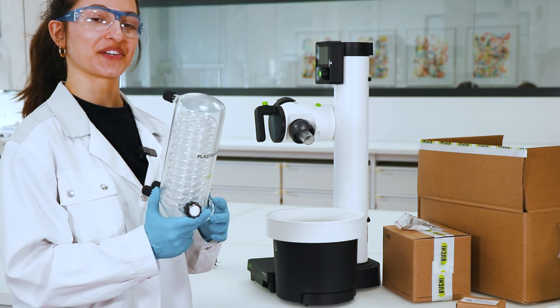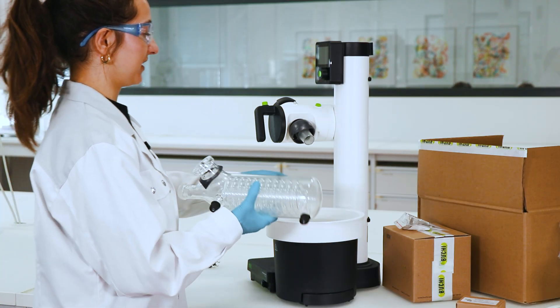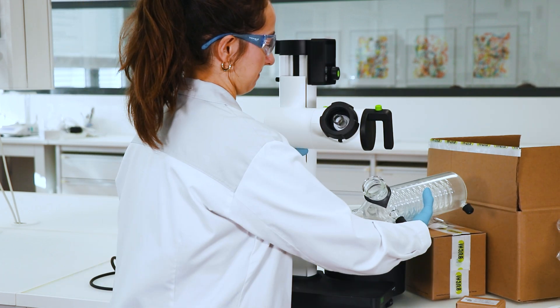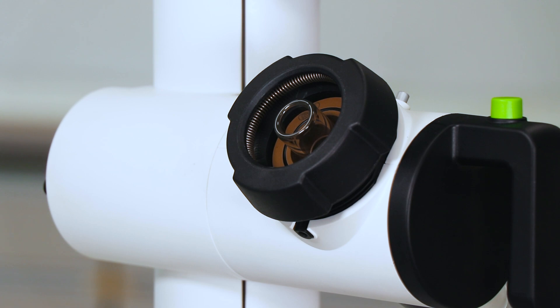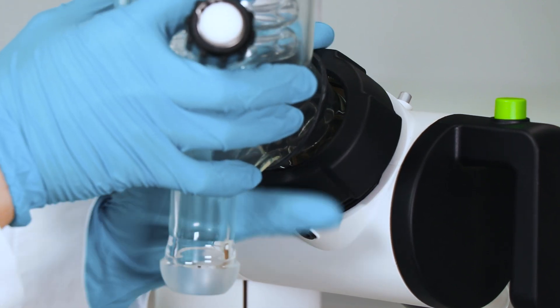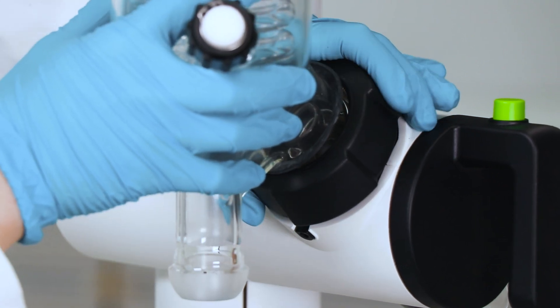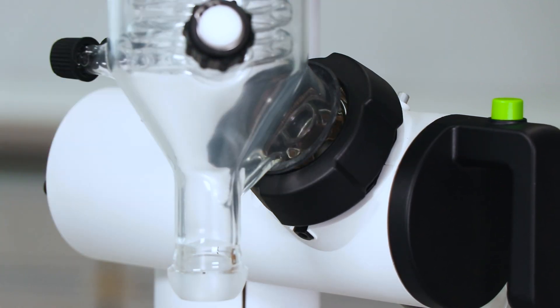Okay, so then the next thing is the condenser. I'm actually going to turn the R80 so you can see it better. Okay, so what you do is, this part goes in here, and you just turn the flask knot to secure it tightly, so like this.